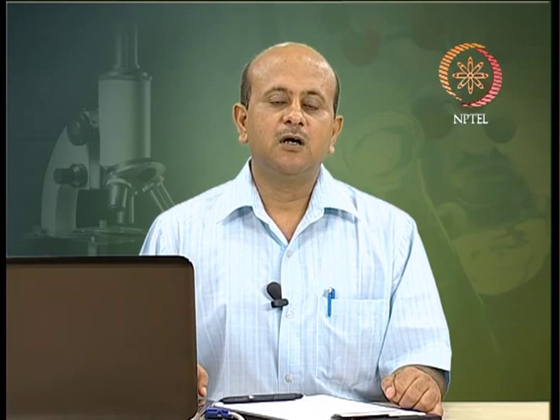Now, as we have discussed earlier, UV-vis is an absorption spectroscopy, but fluorescence spectroscopy is an emission spectroscopy. It is complementary to the absorption spectroscopy. Here, molecules have various states which are energy levels. In fluorescence spectroscopy, what is done is there is excitation. It is concerned primarily with electronic and vibrational states, as we have shown in the energy diagram.